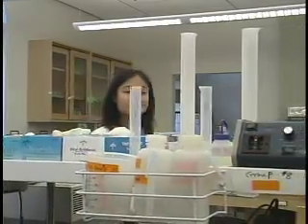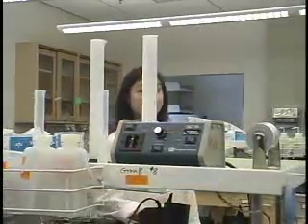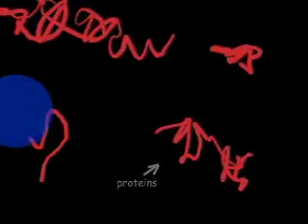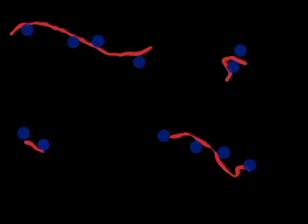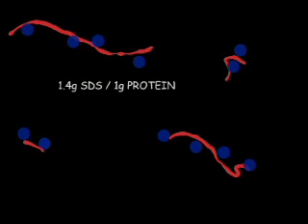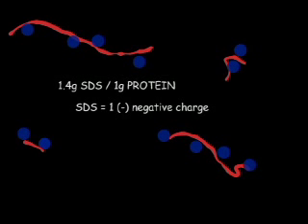Sodium dodecyl sulfate polyacrylamide gel electrophoresis, or SDS-Page, is a common tool used by biochemists to discover the molecular weights of proteins in a protein sample. The technique separates the different proteins in a sample by their sizes. In the procedure, the sample to be analyzed is first mixed with the detergent SDS. SDS binds to all proteins and breaks up all weak bonds, smoothing them out so that they exist in long rope-like chains. SDS binds 1.4 grams per gram of protein, and each bound SDS has one negative charge. This gives all the polypeptides in the sample roughly the same charge to mass ratio.